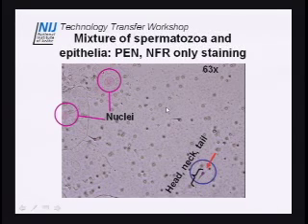And then, of course, with your sperm, this is a beautiful sperm. But we all know with forensic evidence, it's rare if I see something like this. So this is a sperm with a head, neck, and tail. And you notice here the nice cap, the acrosome, that clear acrosome on top, the pink nuclear stained sperm head, and then, of course, your beautiful tail. But again, we don't see that very often.